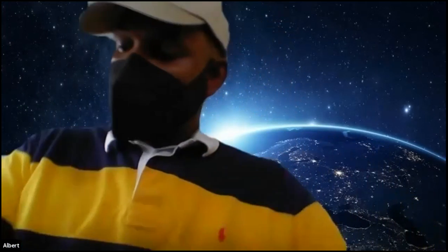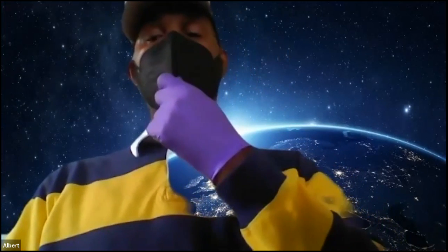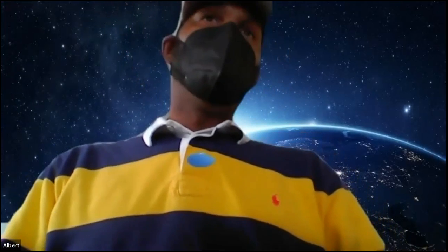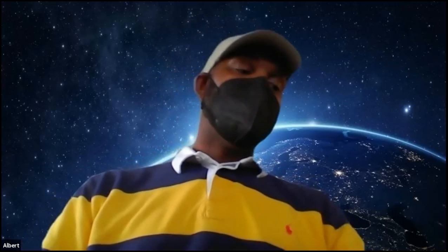Can you go over just one more time everything that we needed to write down? I just want to make sure I'm not missing anything. You mean for today? Yes. On the third table, we wrote the amount of ethanol, the time elapsed during the recrystallization, and whether or not we did a hot gravity filtration, which the answer to that is no, we did not do a hot gravity filtration. And then the reagent table we filled out last week. Gotcha. Thank you.